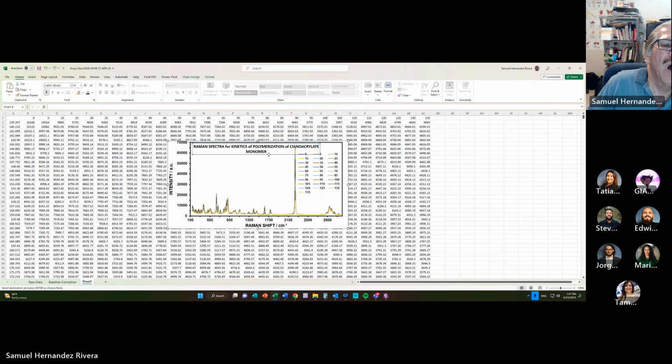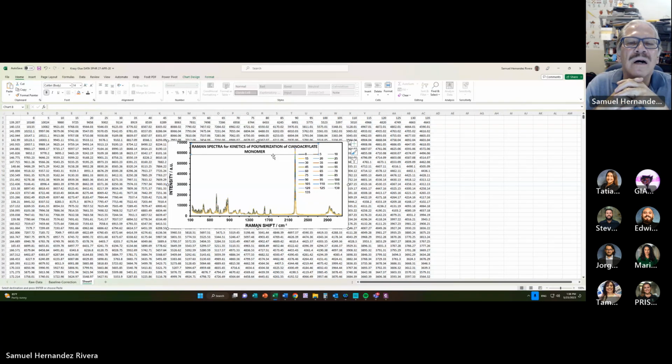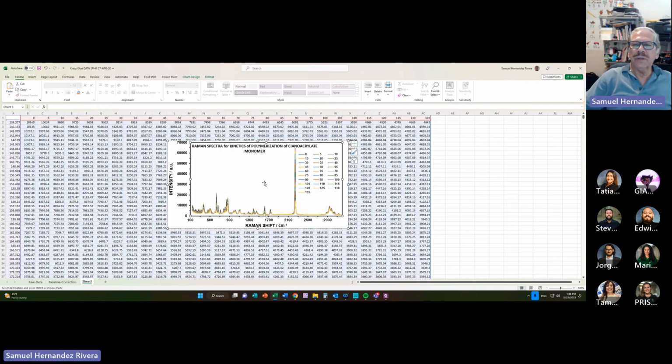We'll have it. Okay, there. It doesn't want to move. So let's help it. There. Okay. Let me do the following. Let me move the graph all the way to the left.